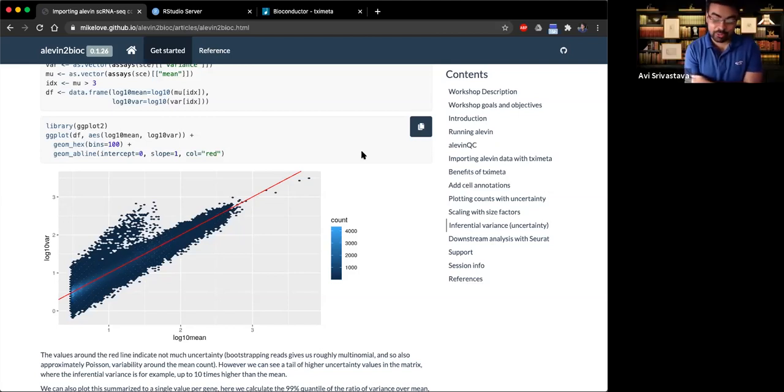Like I was saying, when Alevin was designed, it was designed for, let's say, 20 or 100,000 cells. Right now, we are at a million cells in one experiment, specifically if we talk about combinatorial indexing. So we are scaling things up by quite a lot. And like I was saying, there's a Rust implementation coming very, very soon. And we're going to modify a bit about tximport if we see it's taking too much time. But that's quite a bit of experimentation. For 100,000 cells, it should not matter much. But if you talk about a million cells, we are in the experimental stage, even for quantification and then for the import downstream.